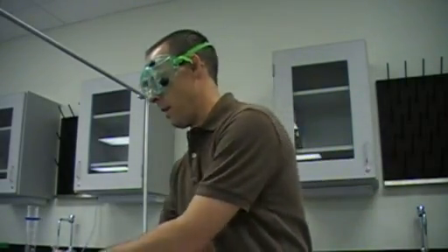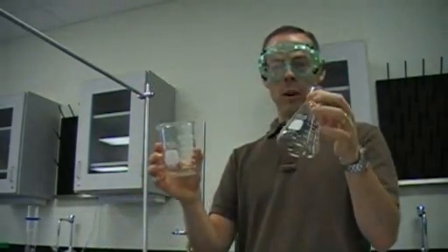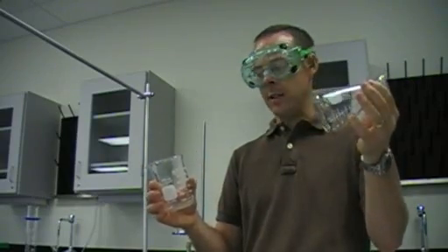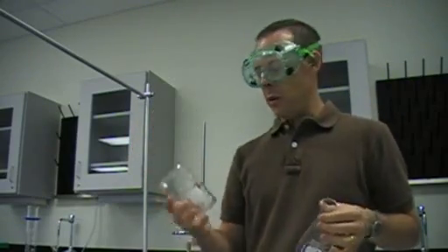If I need a specific amount of liquid, you will use one of these two pieces of equipment. If I need an approximate amount of liquid, you would use a beaker or a flask. Flask less frequently just because of the cost associated with it, and beakers you won't have all the time.